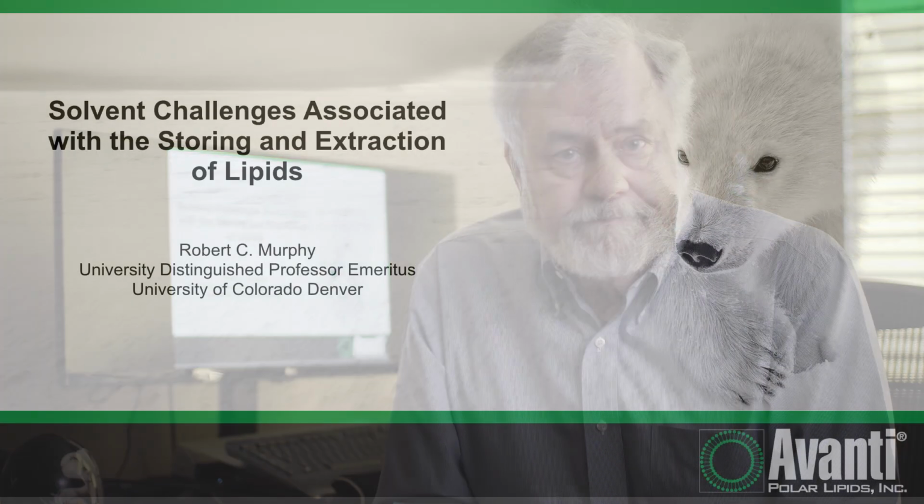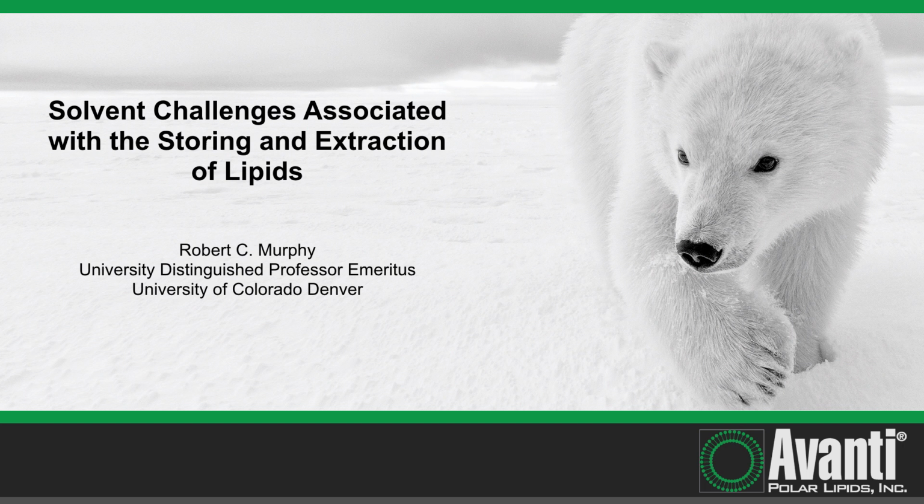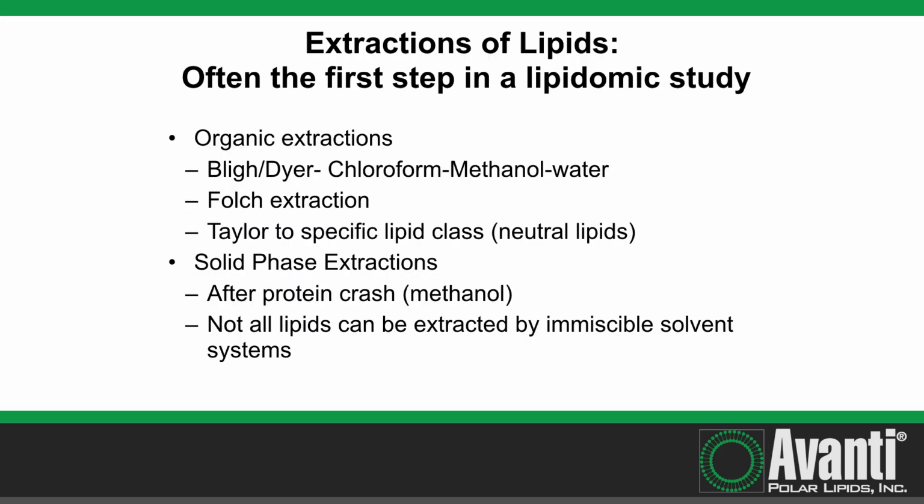This particular video has to do with problems one might encounter with some solvent extractions, an important first step in all lipidomic studies. So this video presents some of the challenges which you may encounter working with lipids when you extract them with organic, immiscible solvents, and also storing the lipids in these solvents. And it's maybe some advice on what you may be on the lookout for when you're using different solvents.